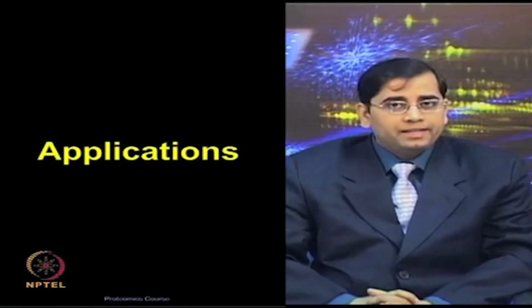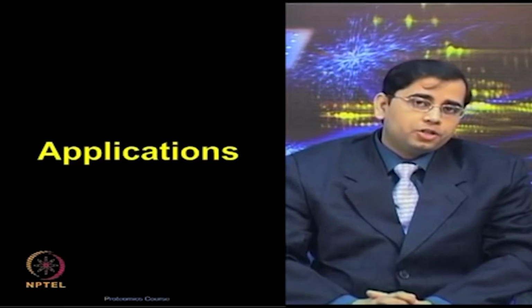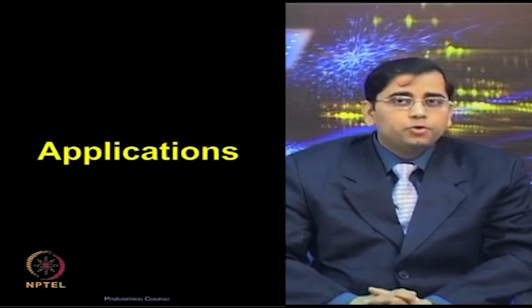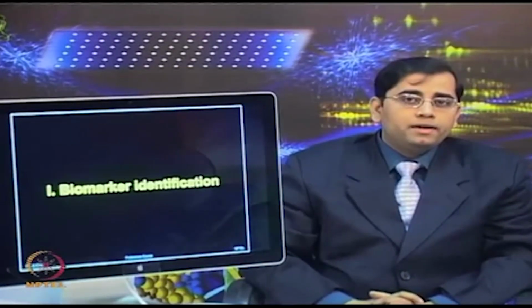After watching this video and discussing the various steps which are involved in any protein microarray based experiment, let us now look at some applications of cell-free based protein microarrays. Let us first discuss biomarker identification.